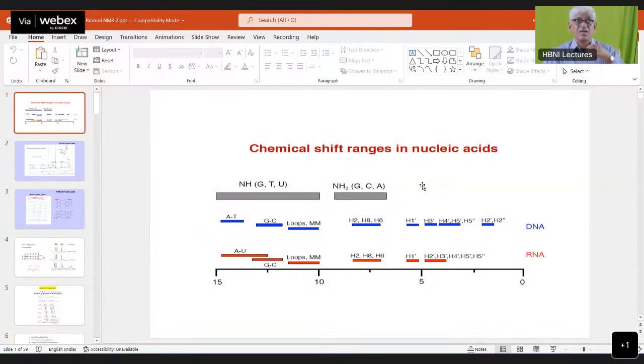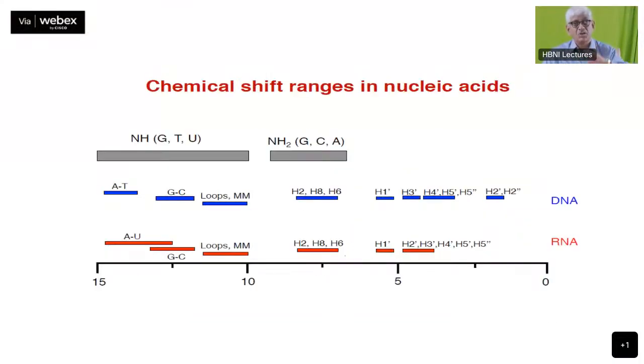Okay, so now we are all set to use NMR to understand DNA, RNA structures and the interactions. And here, all this background was necessary to be able to understand the NMR analysis. The crystallographic analysis or NMR analysis. NMR analysis deals with things in solution, and individual atom level details one can obtain with regard to the interactions. It will also allow you to see how the dynamics happens in the different DNA molecules or the RNA molecules, how these things happen.